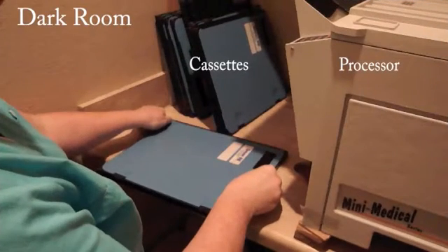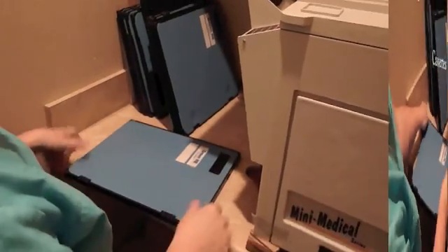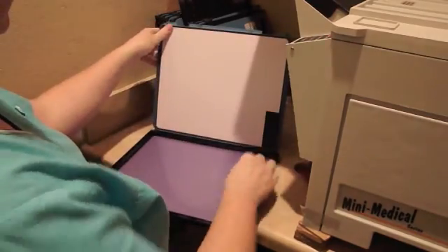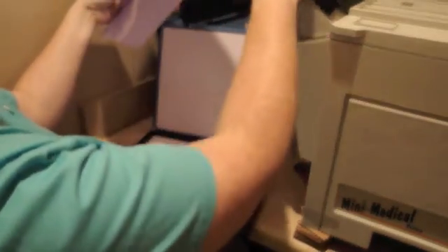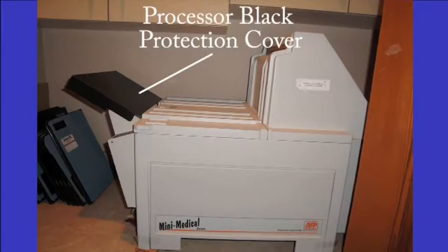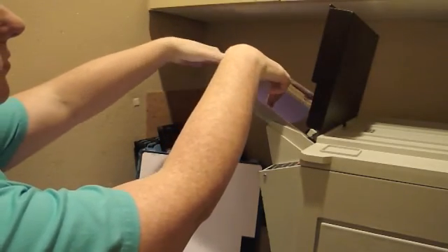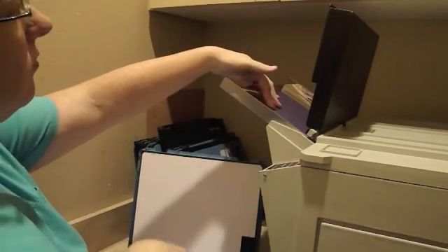To open the cassette, you must be in the darkroom where the processor is located. Make sure the door is shut behind you tightly and the light is off. You will need to open the cassette by sliding the two sliders on top of the film towards each other. Reach inside and pull out the film. The processor has a black protection cover on the left side of the processing tray that you will need to lift up. Feed the film into the processing tray. As you do so, you will feel an automated crank grab and slowly pull the film in.